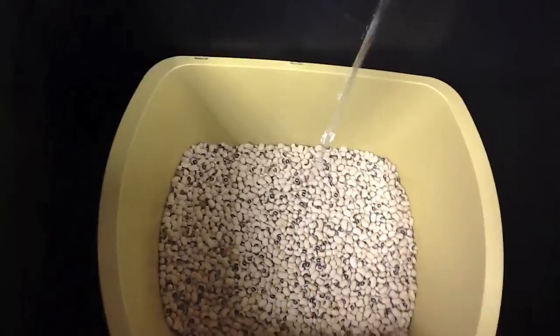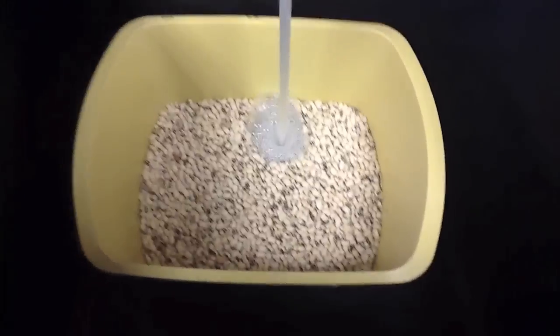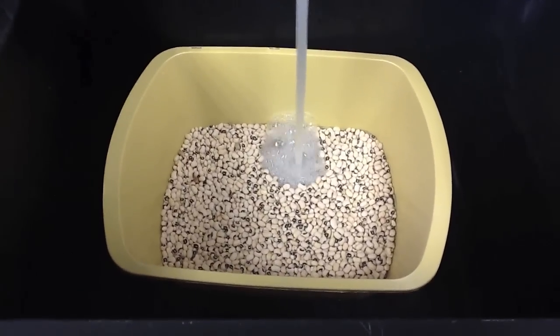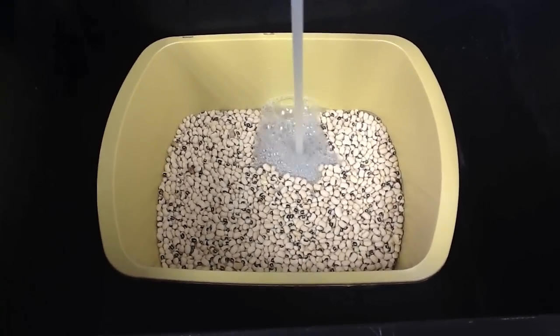In this experiment, we looked at the ability of peas to produce carbon dioxide. Before you started your experiment, your instructor added water to the peas so that the peas would undergo what's known as germination. This is a period of growth after a period of dormancy.